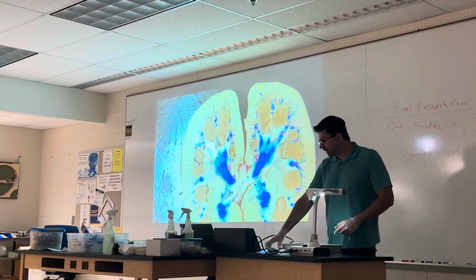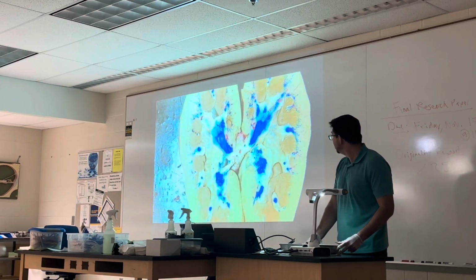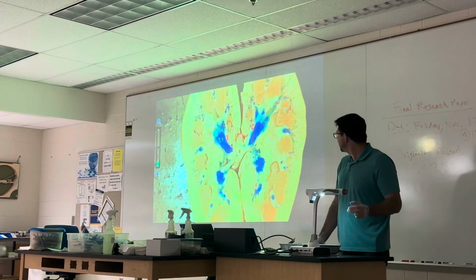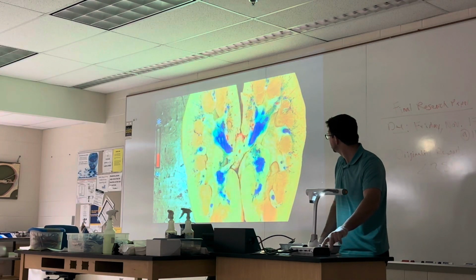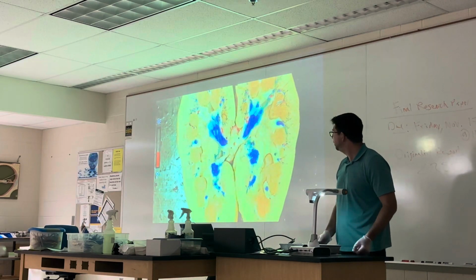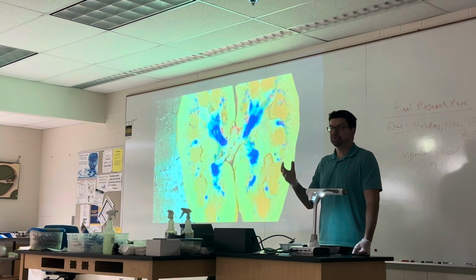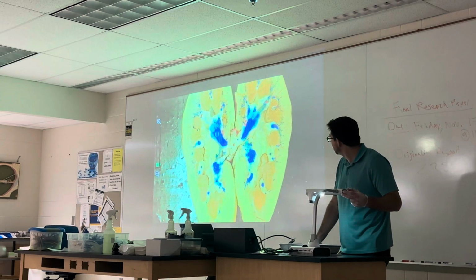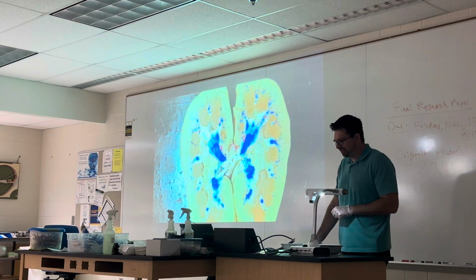All right, so looking at our list here, guys, of items that you need to identify off the pig kidney. And you're able to see the blood vessels because they've all been dye injected with the biological company that we use. They put a blue dye in for the veins, and a red dye for the arteries. It looks like they may have almost put too much dye in here, but hopefully we can still see everything on the one I picked.